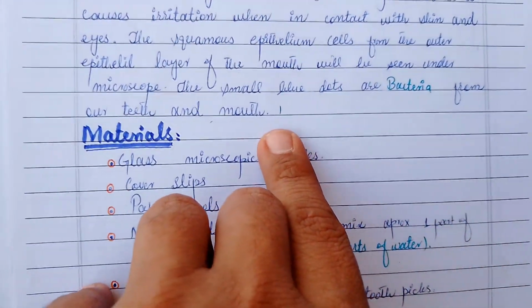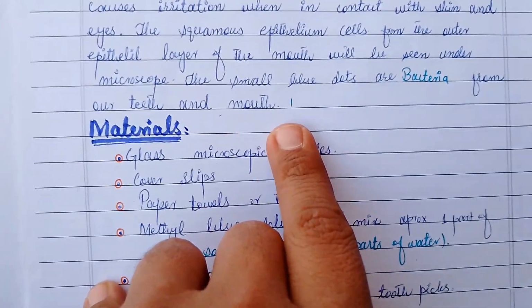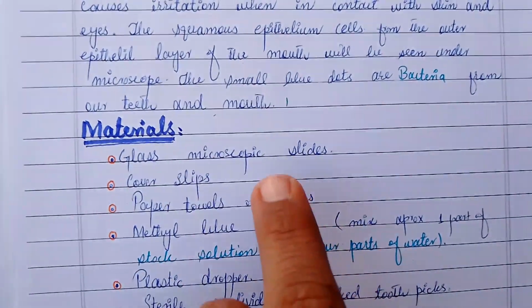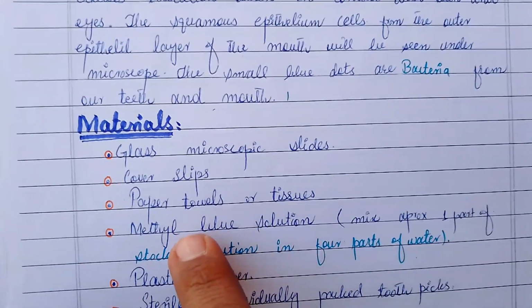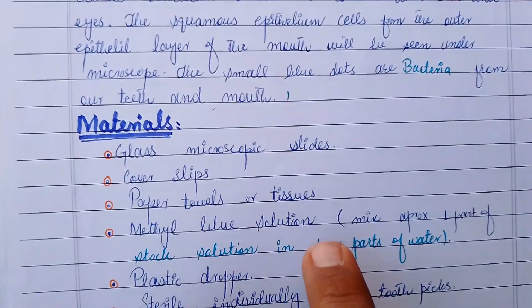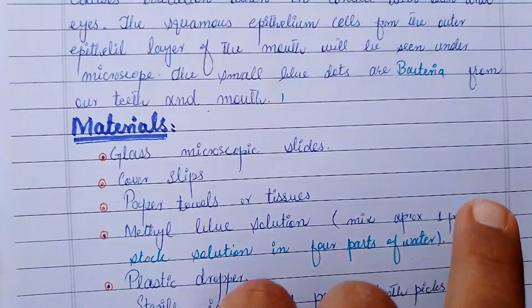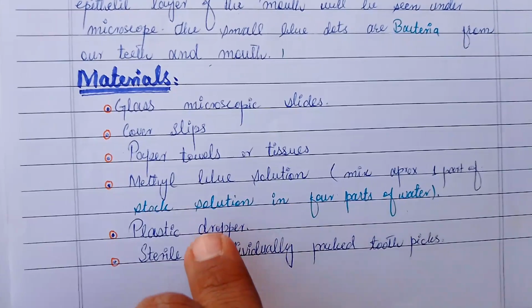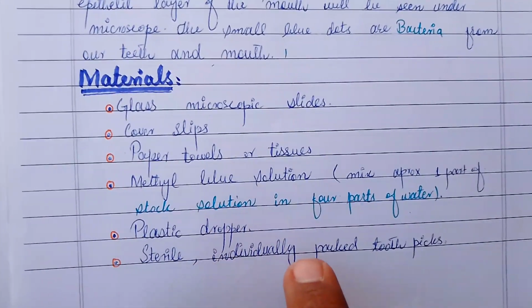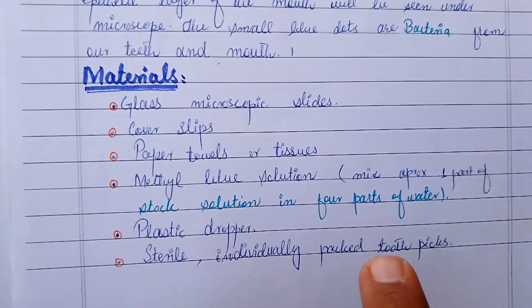Materials required for this experiment include glass microscope slides, cover slips, paper towels or tissues, methylene blue solution. Mix approximately 1 part of stock solution in 4 parts of water. Plastic dropper and sterile individually packed toothpicks.